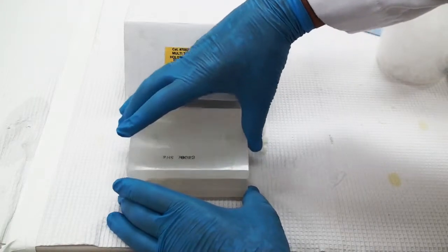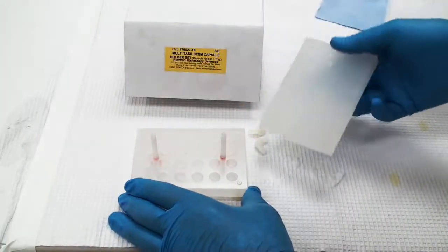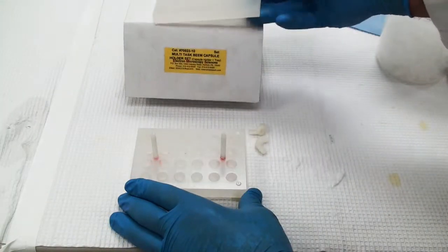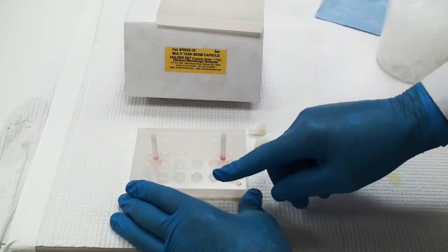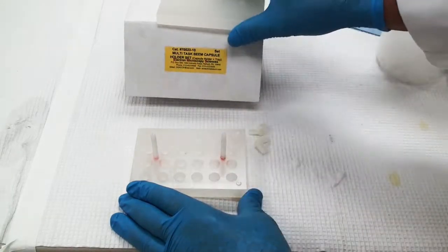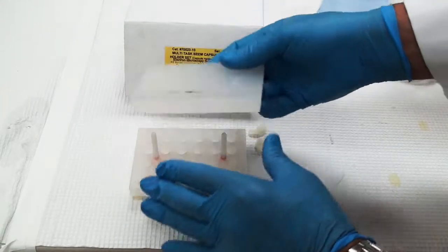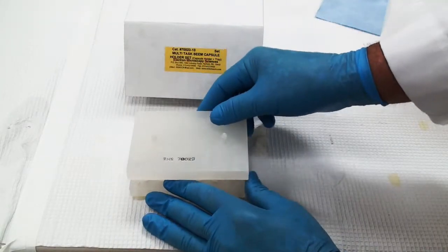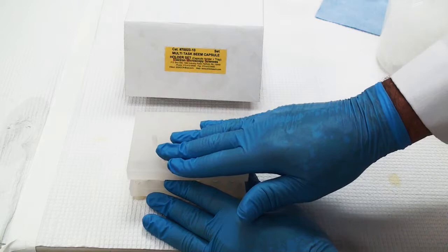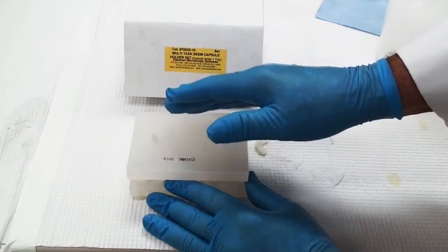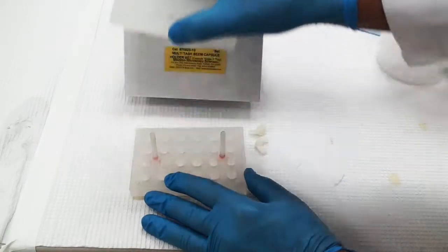It looks like a typical beam capsule holder for double O beam capsules, a variety of number of slots, and then our top is going to go on it, and that's going to compress it down with the top caps on our beam capsules. We don't have to worry about water getting into it.